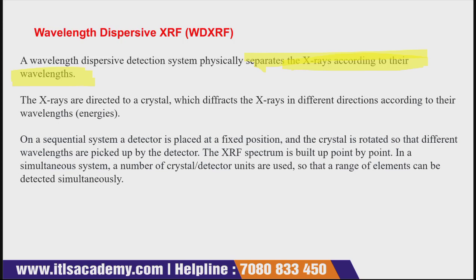When the x-rays pass through a crystal, the crystal diffracts them in different directions according to their wavelengths. In a sequential system, the detector is placed at a fixed position.